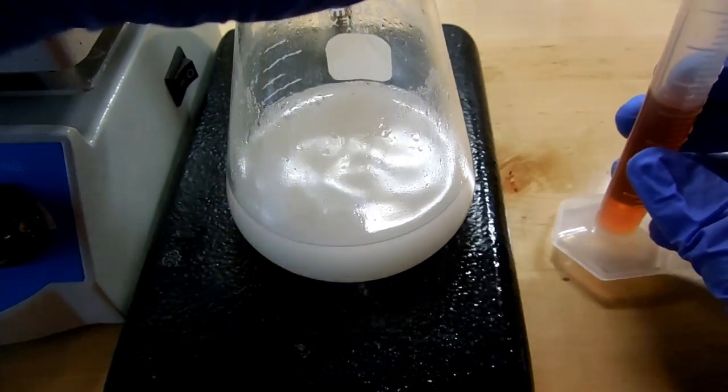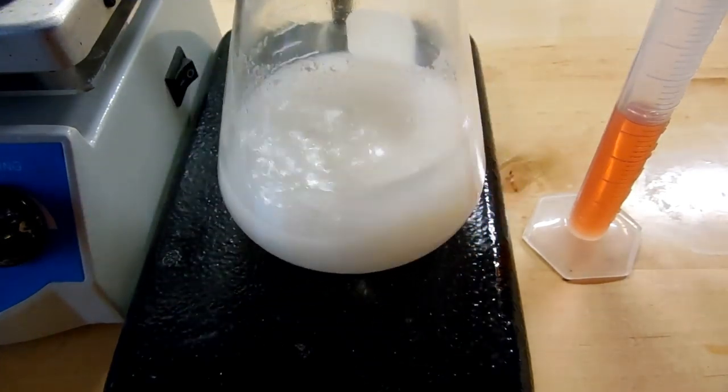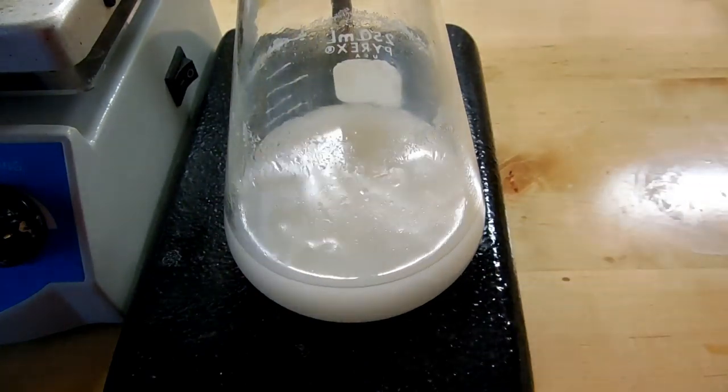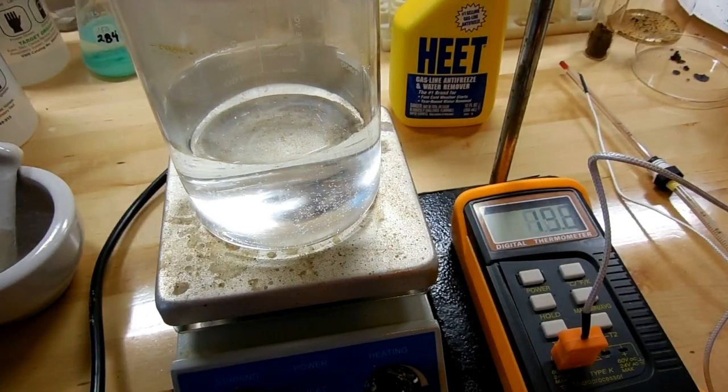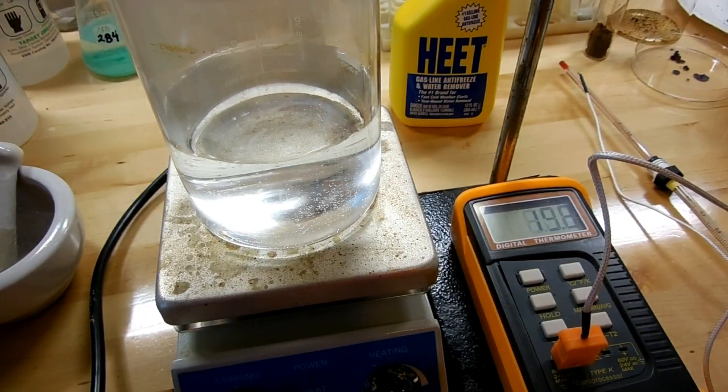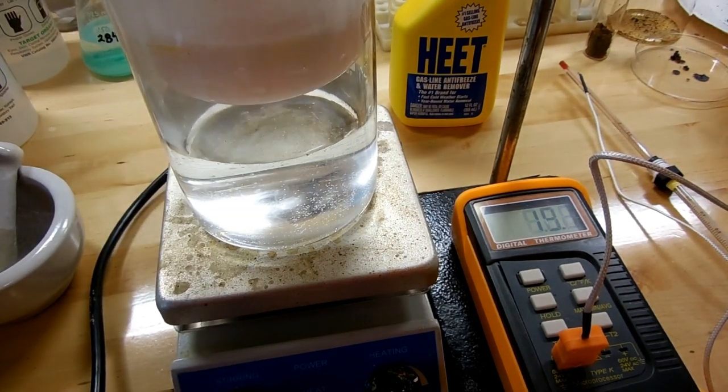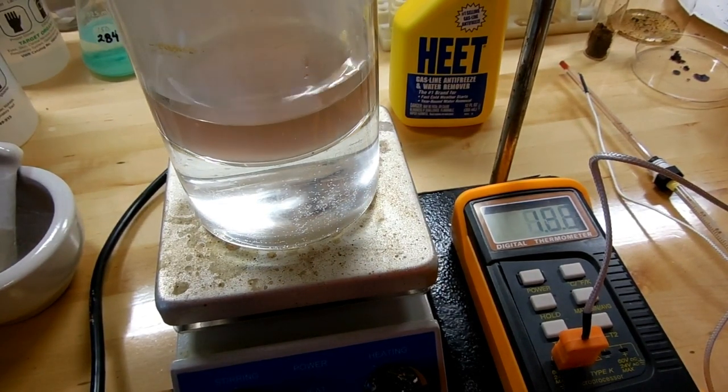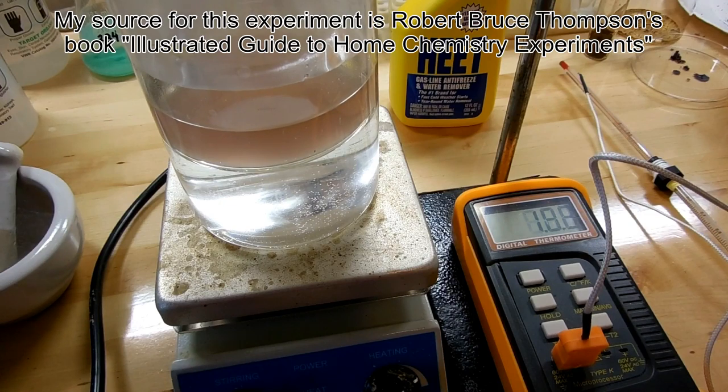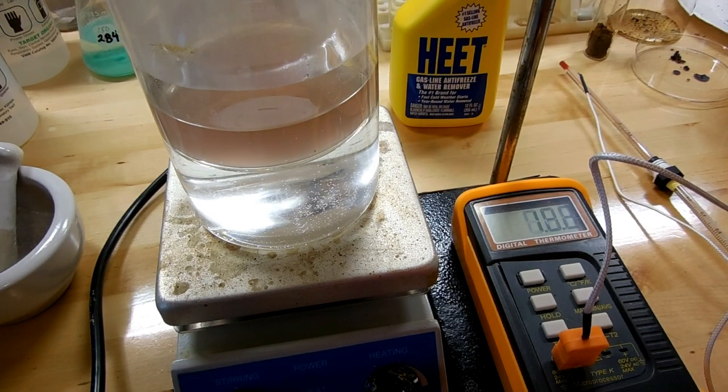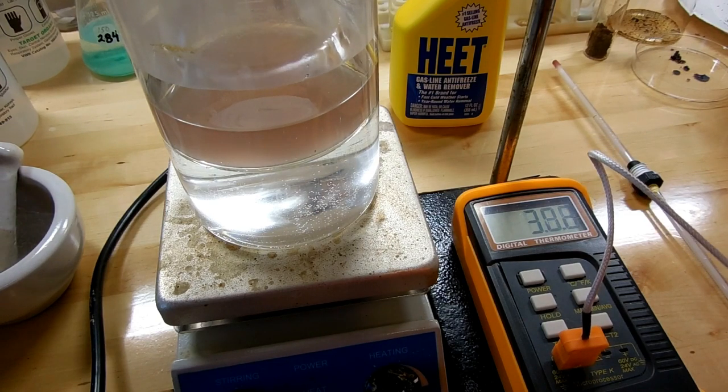We've got everything mixed together and now we want to heat everything for a certain period of time. The procedure calls for an hour and I've done that but you don't get very good yields. So I'm going to try for three or maybe four hours. We want to heat this in a hot water bath up to 60 celsius and I'm measuring that with a thermocouple probe.